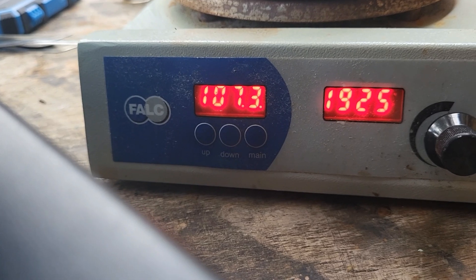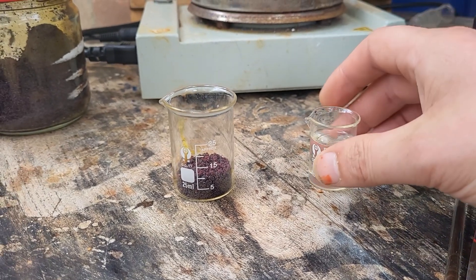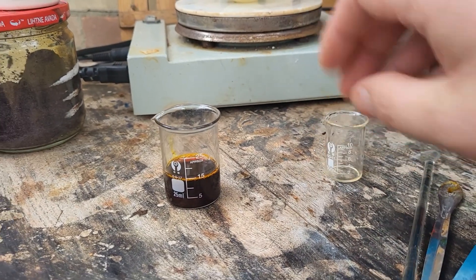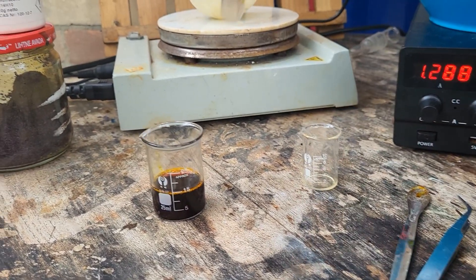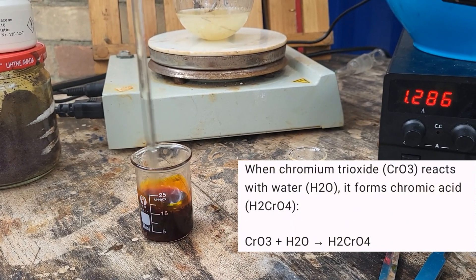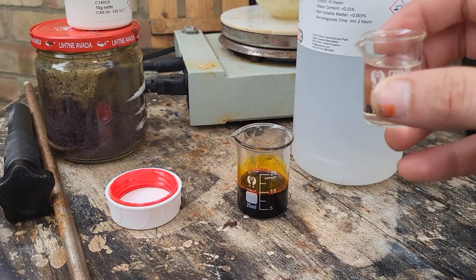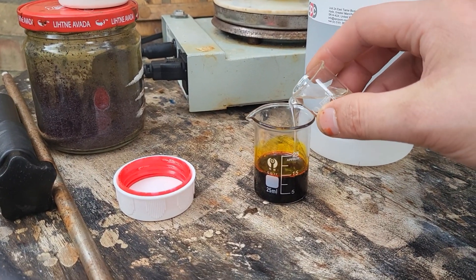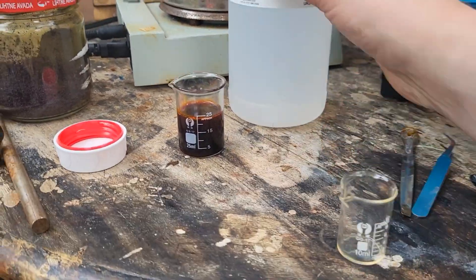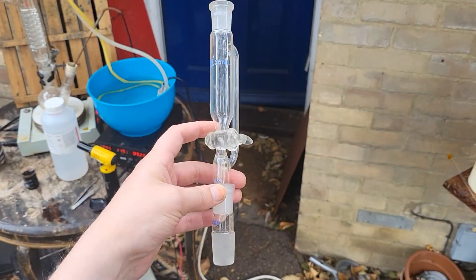107 degrees. To the chromium trioxide I add 10 ml of distilled water. This forms a chromic acid solution. Chromic acid is highly corrosive. To this we add 25 ml of glacial acetic acid, 10 ml at a time. We will charge this addition funnel.